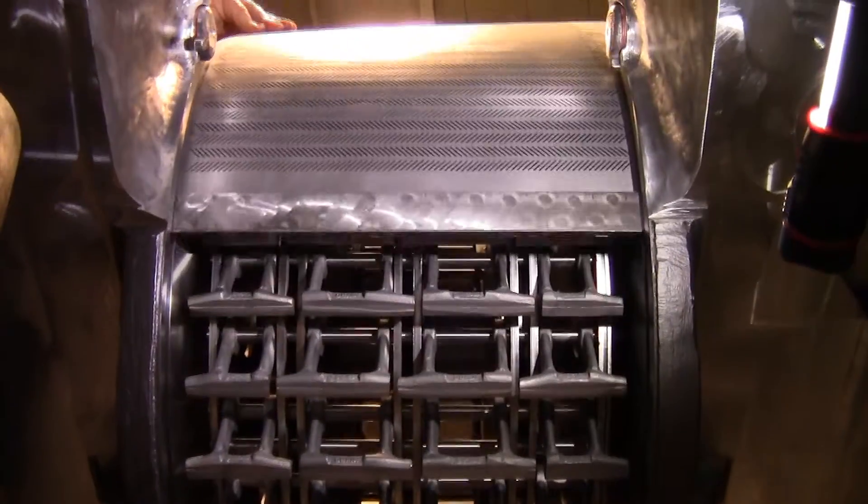Today we're going to show you how to remove a screen assembly from a model 4TH micropulverizer, and then we'll also show you proper installation.